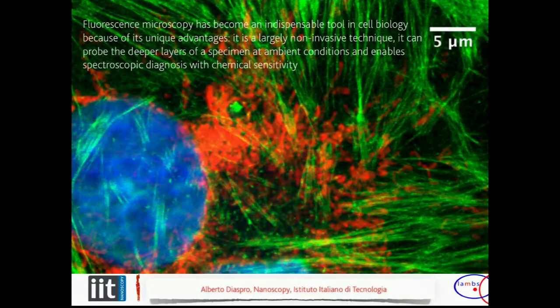And when you use fluorescence with a biological cell, you take advantage of a lot of science made in order to have, biochemically speaking, something very specific for the things you are interested in within the cell, or in cell aggregates, or in cells aggregated in tissues and organs. You can be really very specific.